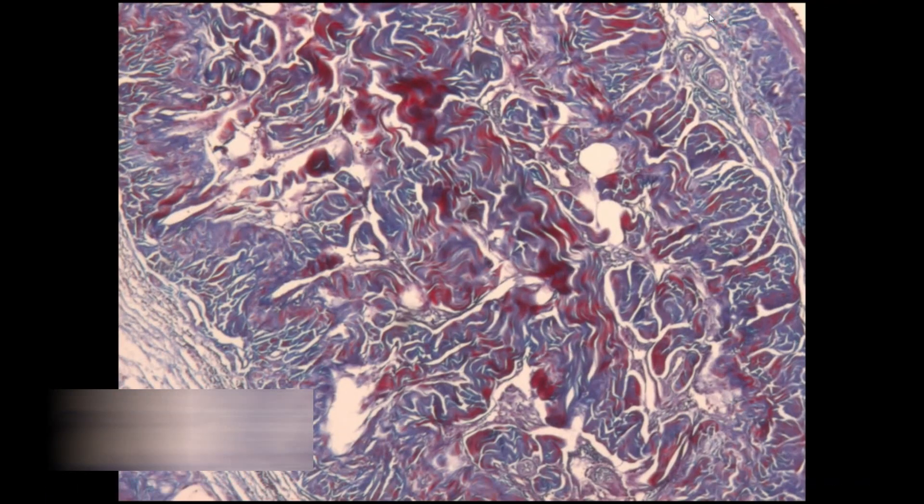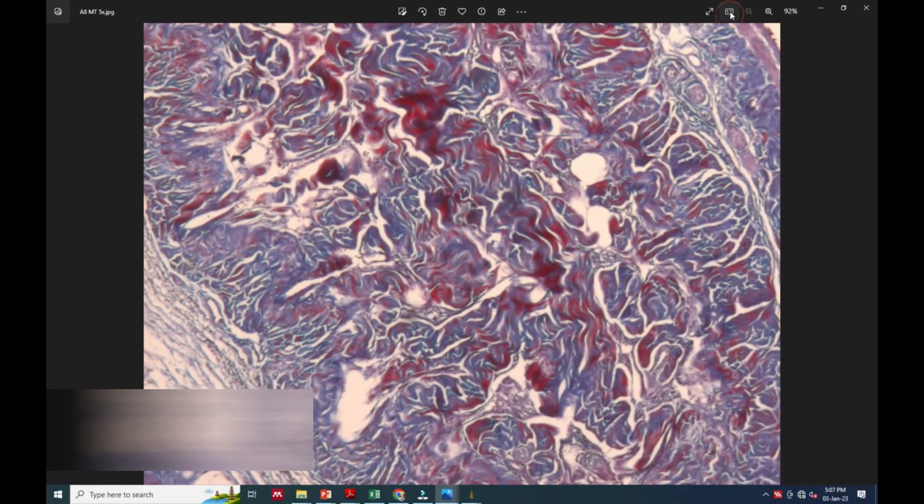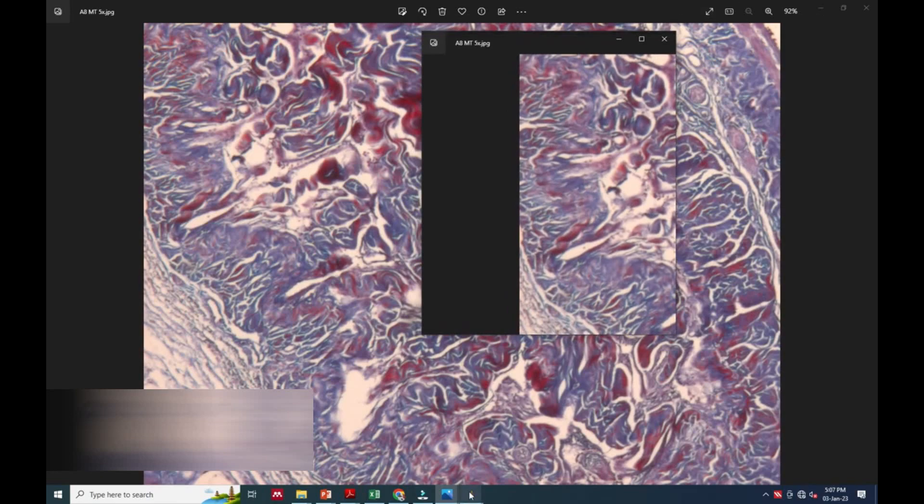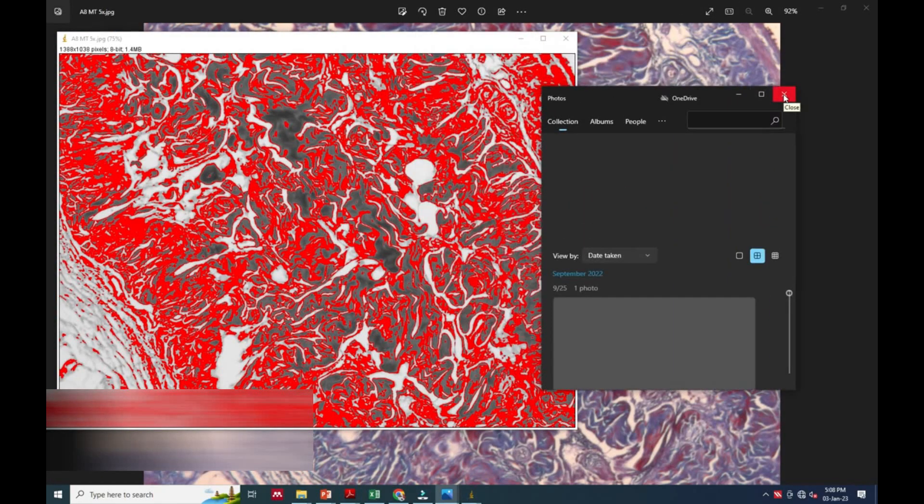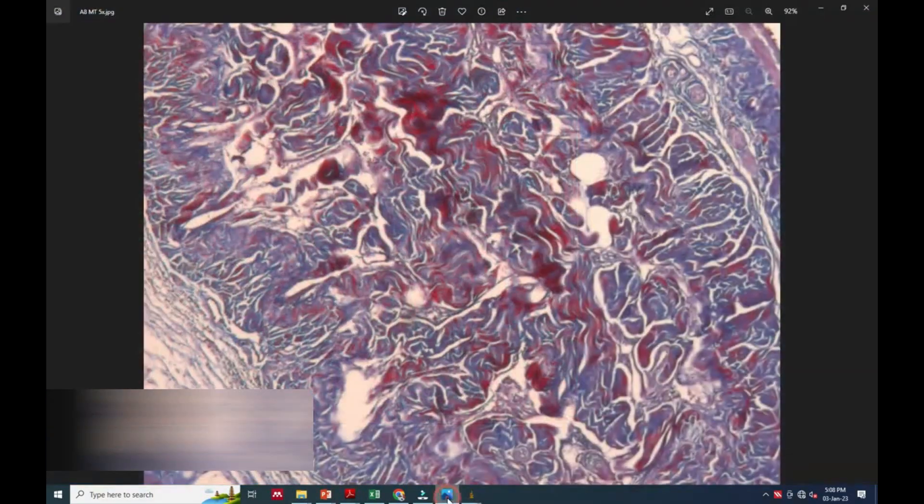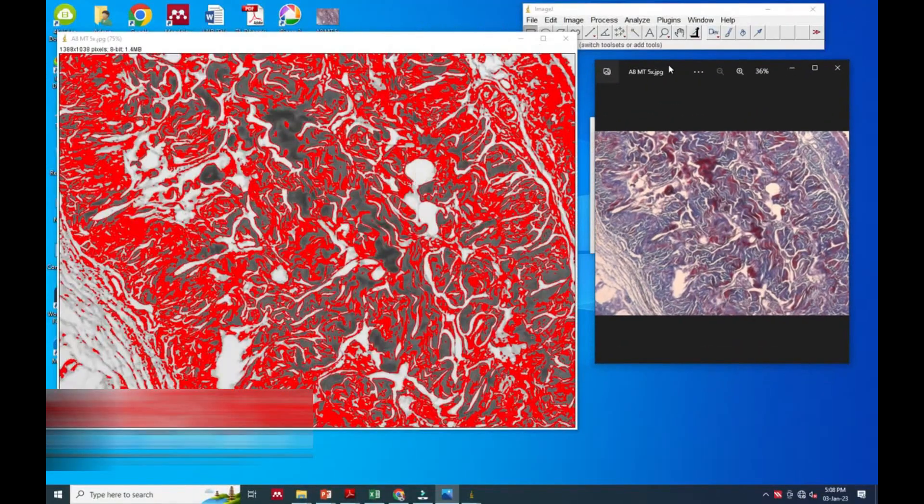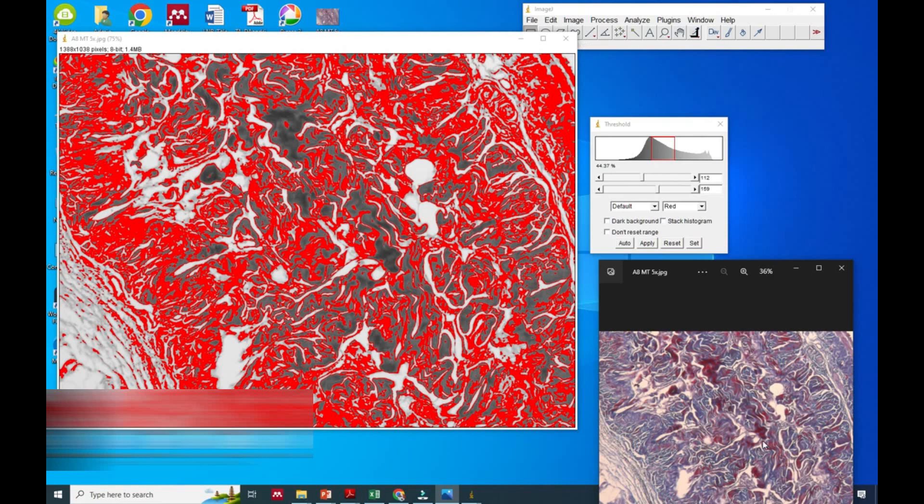Here we will do one thing - we will open the original image and the ImageJ software image. We will keep both adjacent to each other.